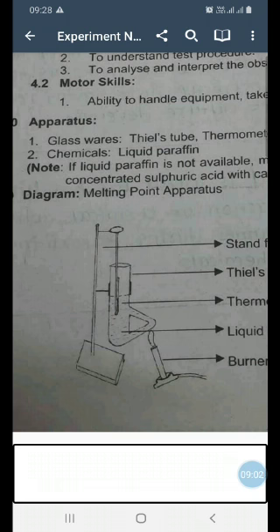In your introductory practical, during our discussion about the things which you must bring in the laboratory while coming for the practical, I have asked to bring thread or rubber band. So here they will be useful. So just tie this filled capillary with the thermometer near its bulb with the help of thread or rubber band or rubber ring.